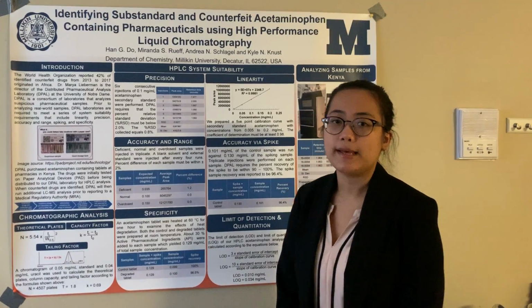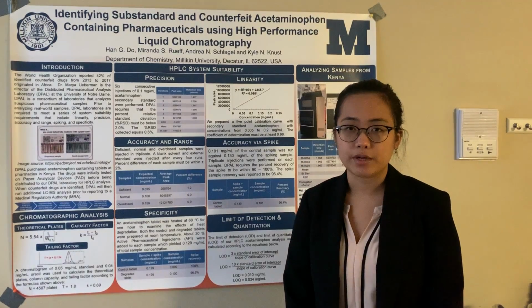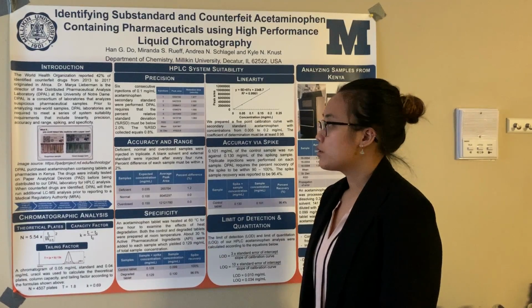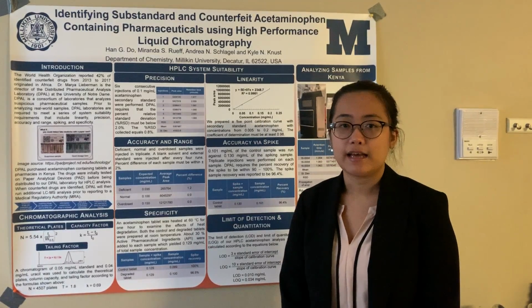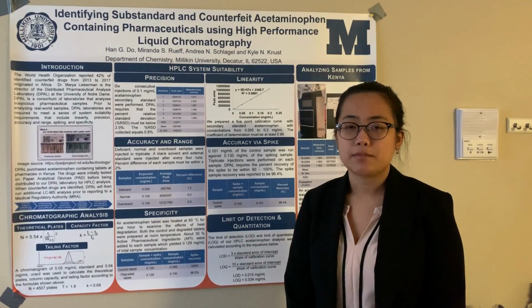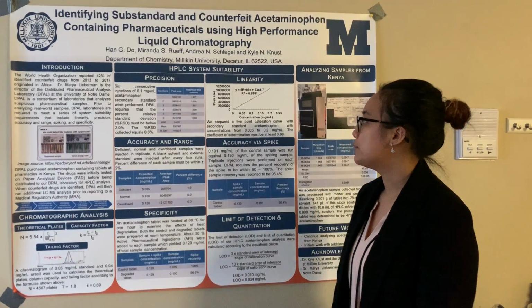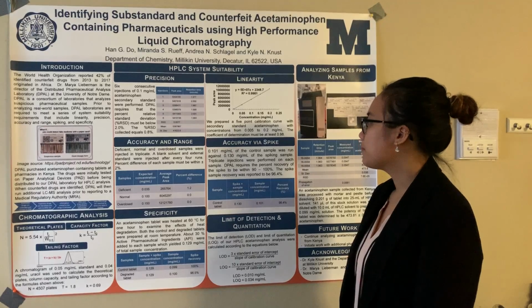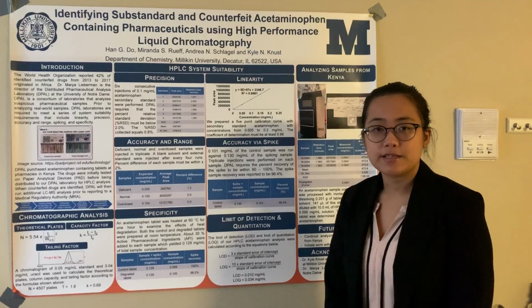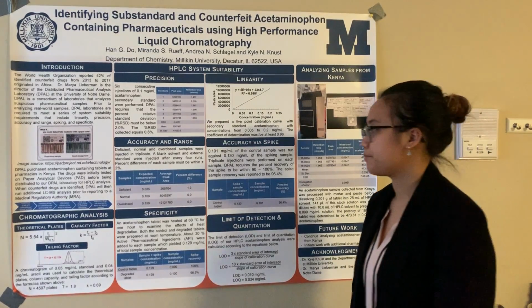Dr. Marya Lieberman is the director of the Distributed Pharmaceutical Analysis Laboratory, DPAL, at the University of Notre Dame. DPAL is a consortium of laboratories that analyze suspicious drug samples. To become a DPAL participant, we have to perform a series of system suitability tests that includes precision, linearity, accuracy and range, accuracy via spike, specificity, limit of detection, and limit of quantitation.